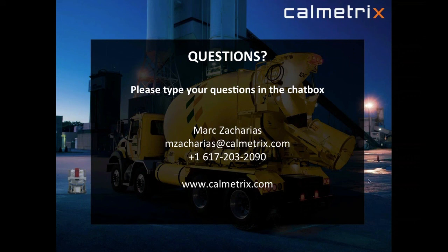One comment again, Mark, from Tom. GRT, love the fact that mixes won't segregate, but it would be great to segregate a mix on purpose, add a VMA, and look at the recovery of cohesion in order to evaluate the efficiency of the VMA. That's right. Actually, yes, we have done similar tests as well.